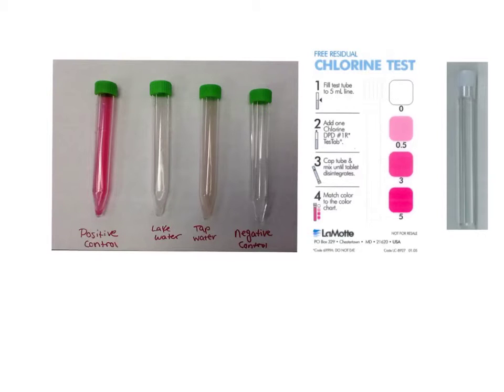Chlorine test number 2. In this tube we have 5ml of water. We are going to add this white tablet to see if chlorine is present in the lake water. Put the cap on and wait until it dissolves. The pink color shows that there are chlorine traces in the water.